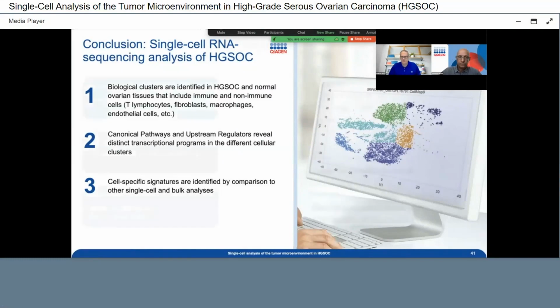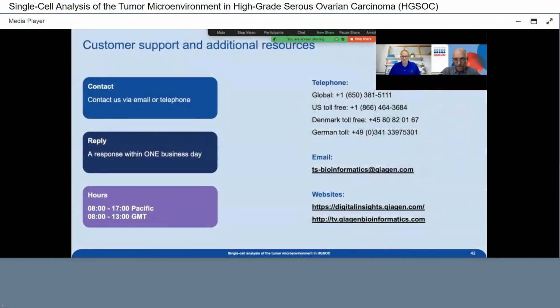First question: the UMAP plots that you showed throughout your presentation, do those come from IPA or do they come from something else? So UMAP is a representation of what they call dimension reduction, and has been provided by CLC Genomics Workbench. As a matter of fact, you process the matrix of FASTQ files, and one of the outputs is the UMAP directly. So it's very easy, and you have that representation in 2D or 3D. So CLC in that particular situation.